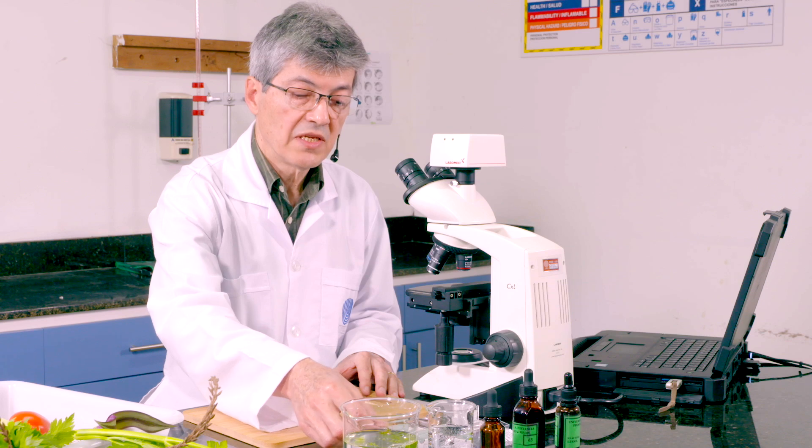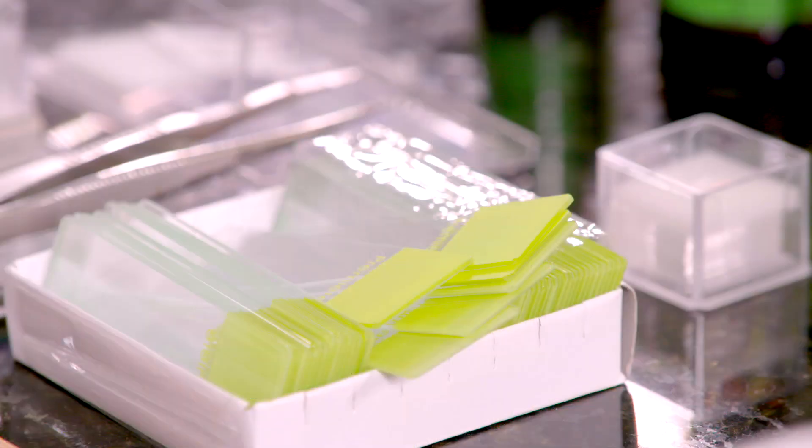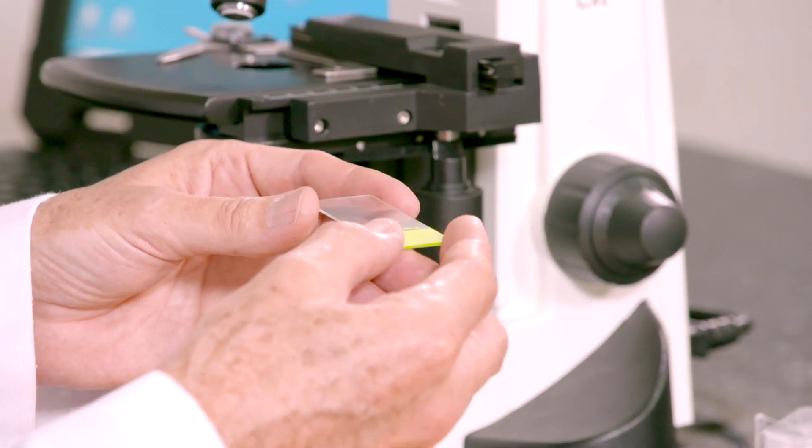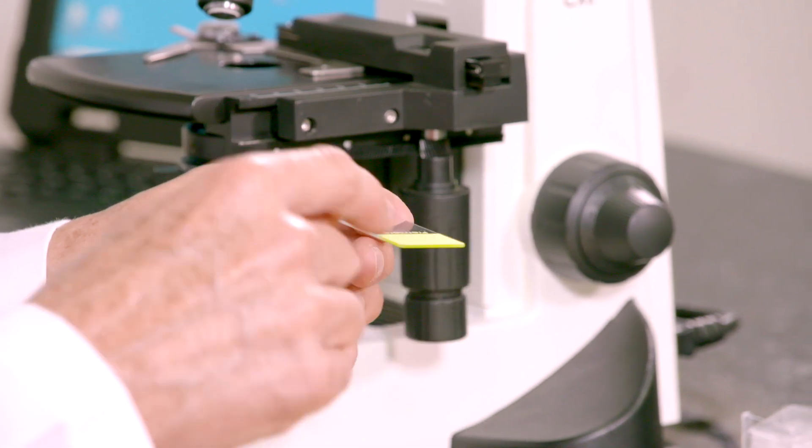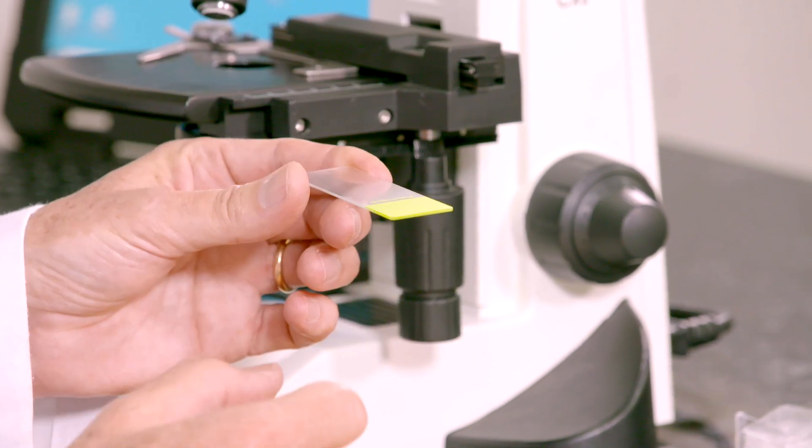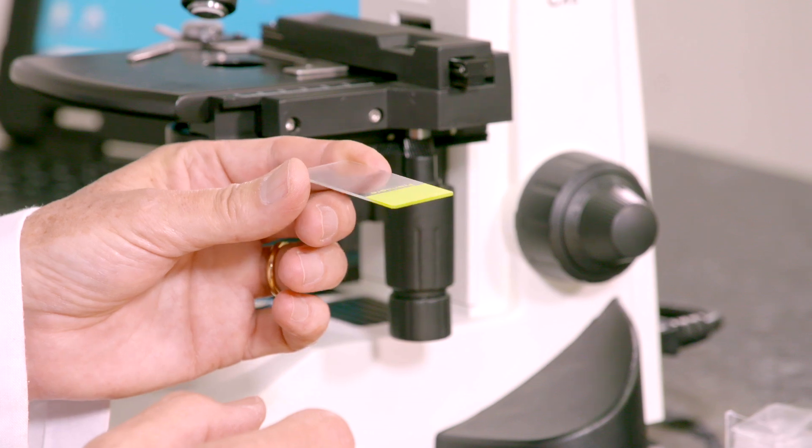Acá tenemos los materiales que vamos a utilizar. Primero que todo, necesitamos estos pequeños cristales, se llaman portaobjetos. Estos portaobjetos se llaman así porque aquí vamos a ubicar la muestra que vamos a estudiar.